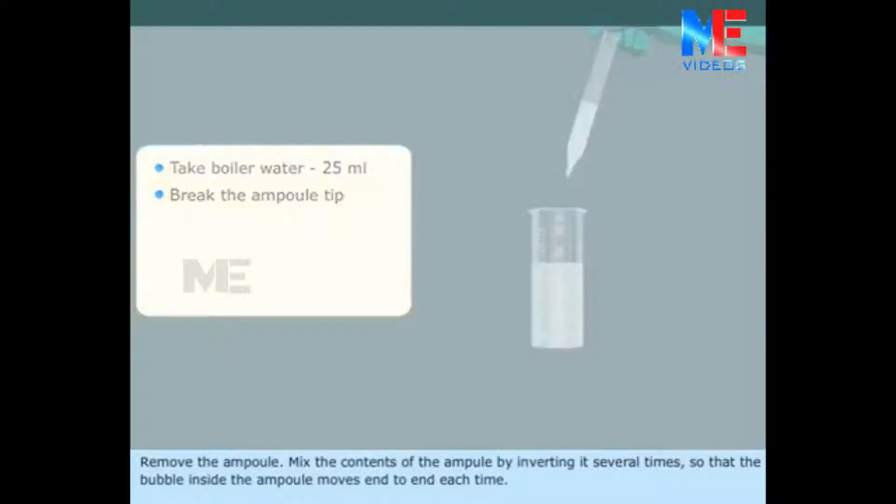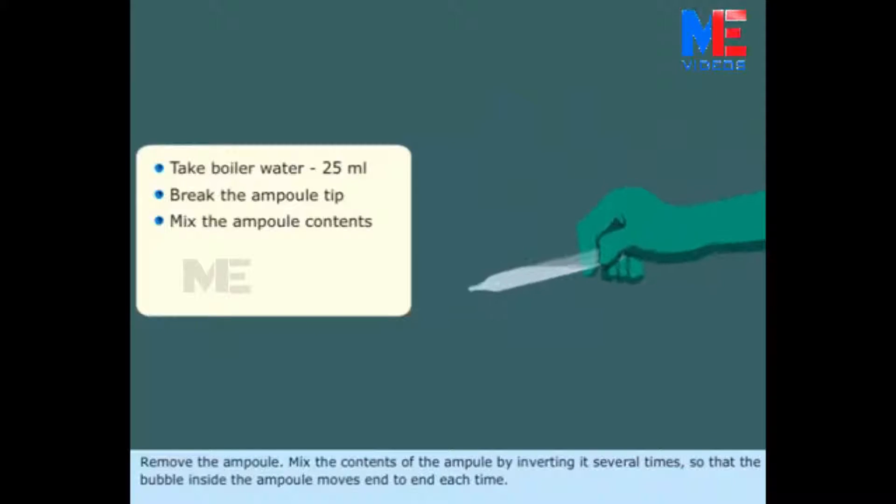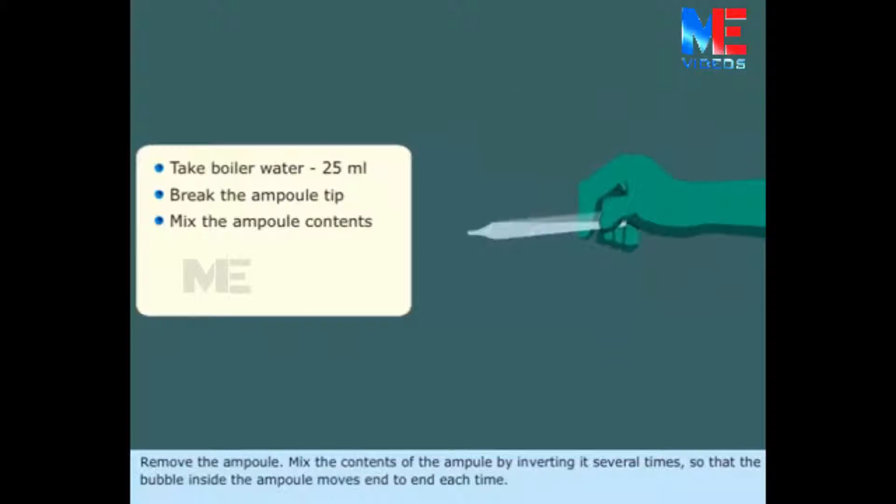Remove the ampoule. Mix the contents of the ampoule by inverting it several times so that the bubble inside the ampoule moves end to end each time.